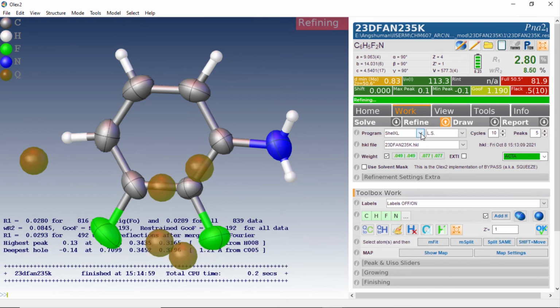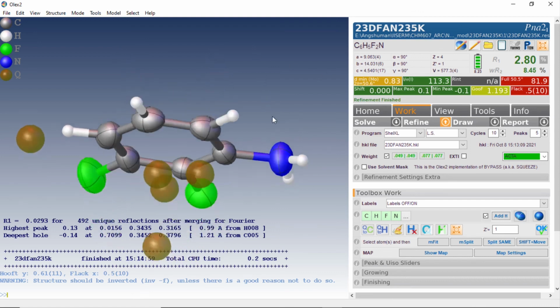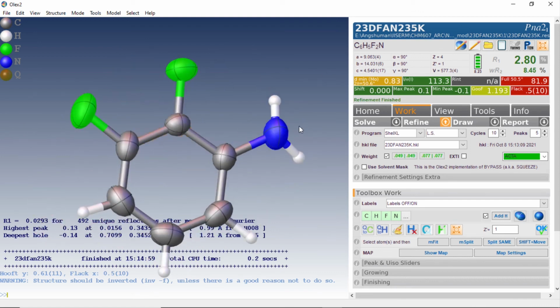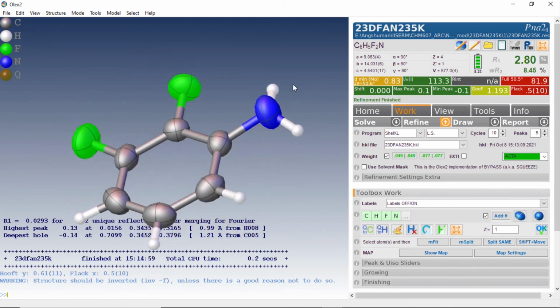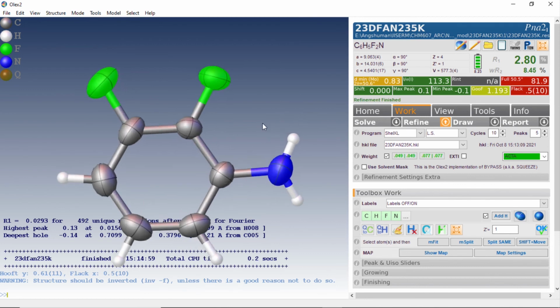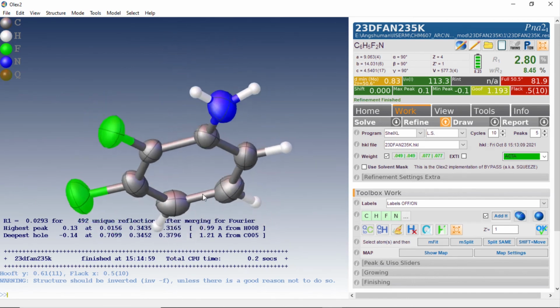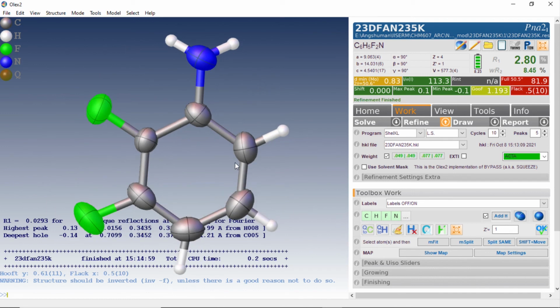The points which are orange or red here are the problem points, because the data is not a very good data, the crystal did not diffract, and the standard problem of in situ crystallization is that we cannot rotate the kappa during the measurement, and that is why the completeness is always less. But what we can show you here is that the crystal data which was not possible to index using a normal procedure, the structure can be solved if we follow this method.